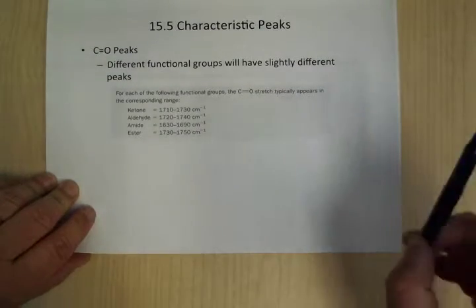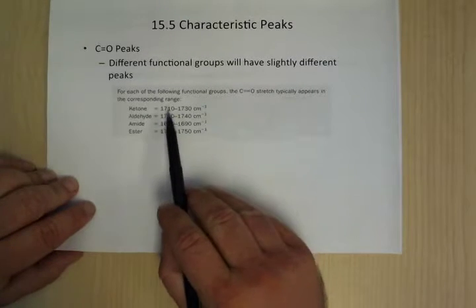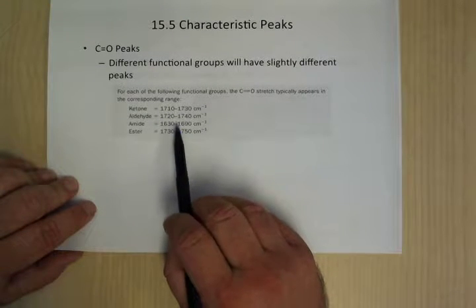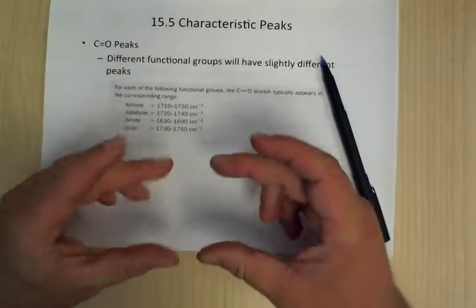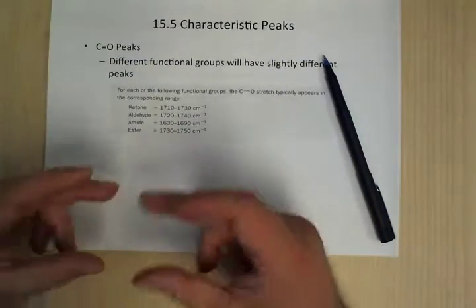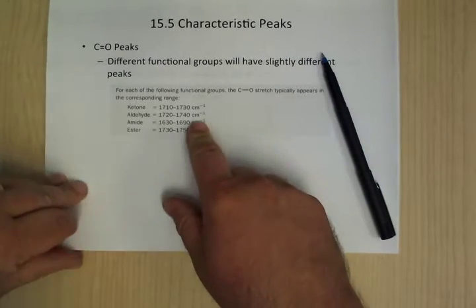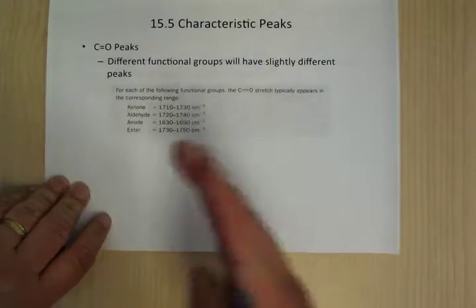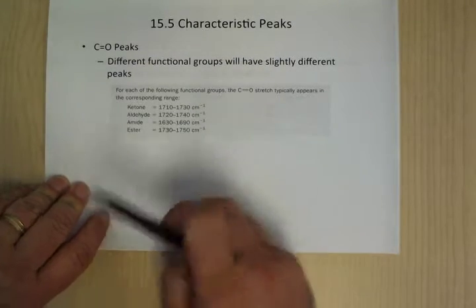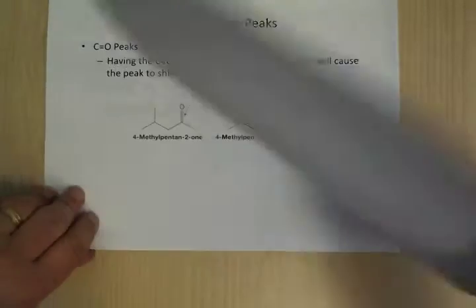Okay, so just for some characteristic peaks here, so the C double bond O peaks, stuff like that. So these are very, very classic, sort of right around 1700. If they give you a little spectrum, it's really hard to tell where they are, but you know at least that there's a peak at 1700. I'm going to give you the specific numbers, but recognize that these are going to be very characteristic. They're going to be slightly shifted depending on what kind of functional group that C double bond O is part of. Okay, but it's a very characteristic peak.